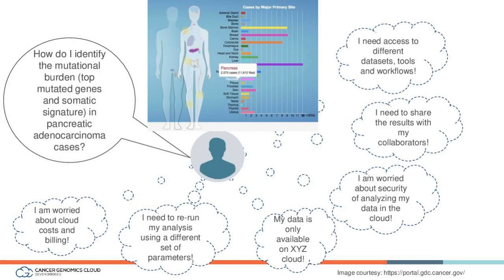And then there are lots of public data sets available, but then you are doing your own sequencing experiments and you want to analyze them safely and in a secure way in the cloud. So what do you do? There's another question that comes to a lot of people's minds.